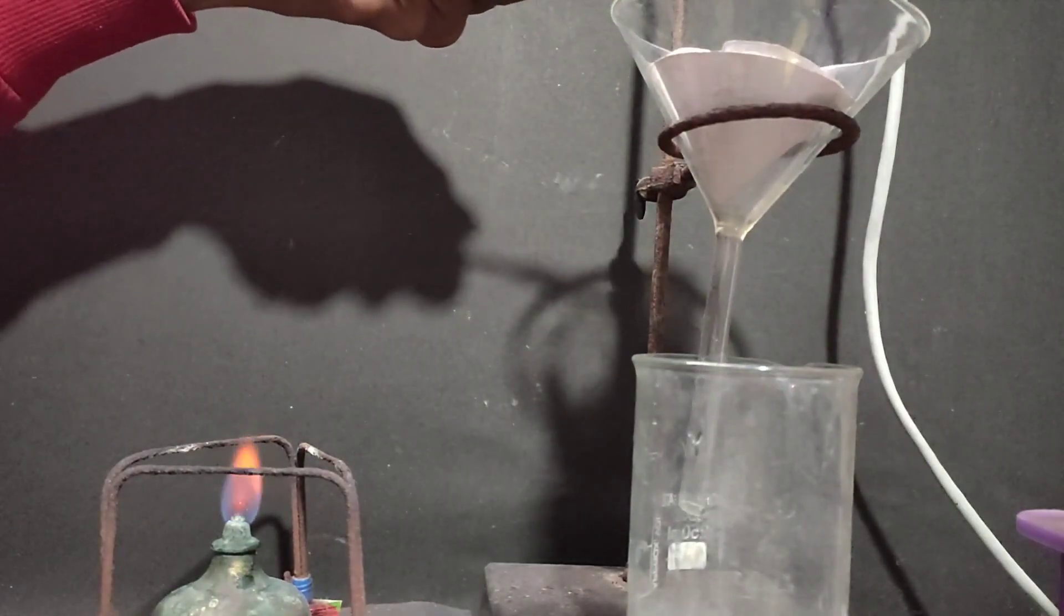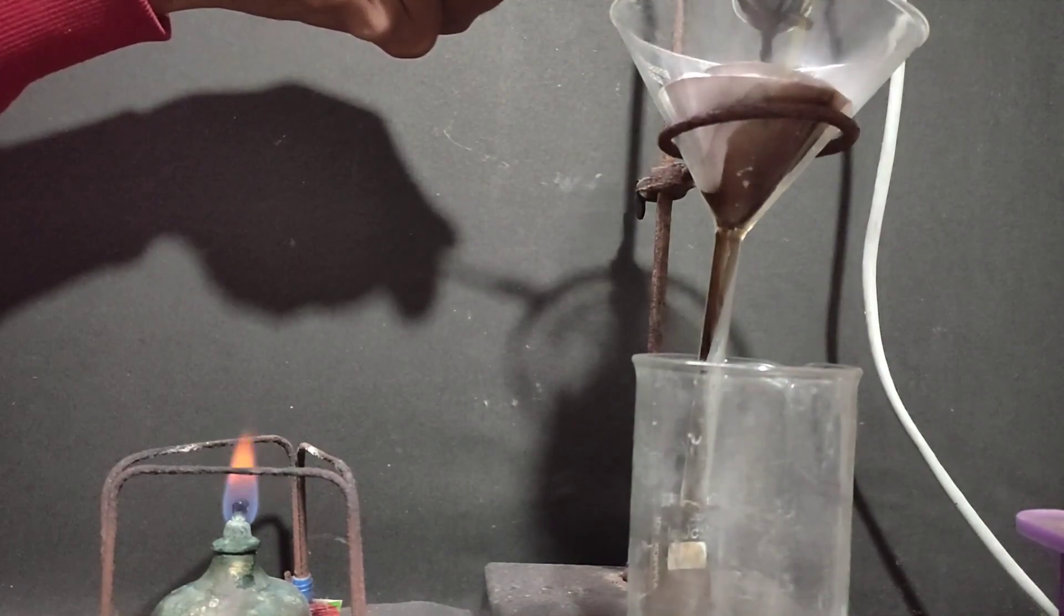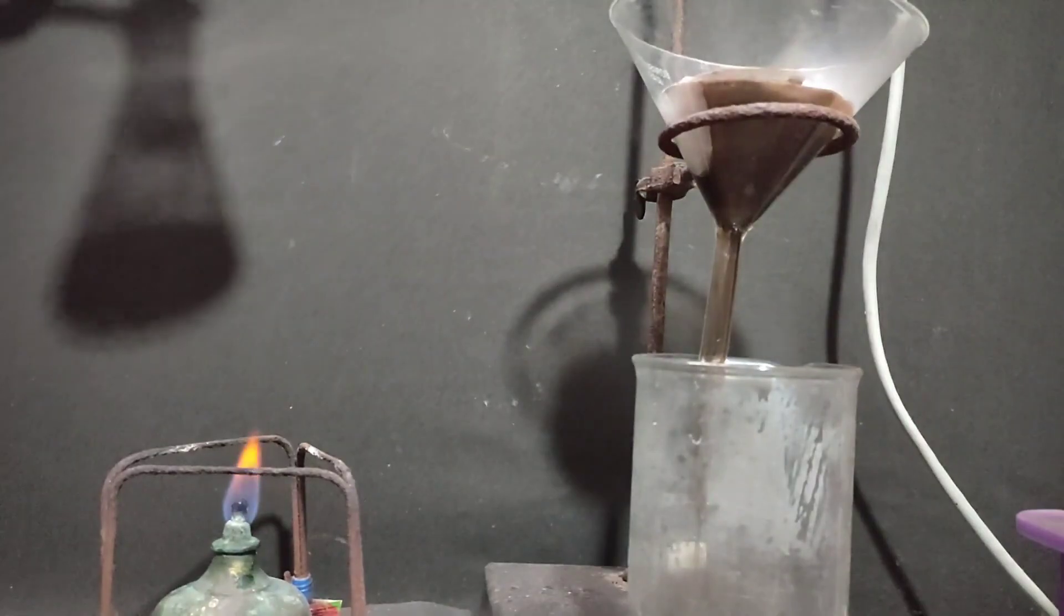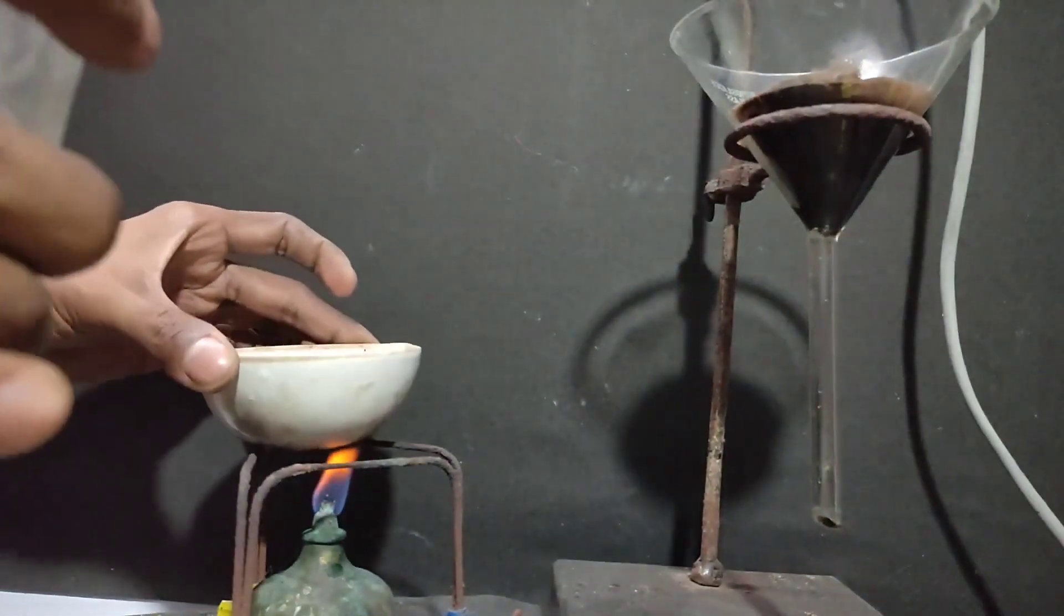The filtrate was black. I filtered it the second time, but still it was black. But this wasn't due to iodine. If it had been due to iodine, it would get decolorized by sodium thiosulfate solution, but it did not.